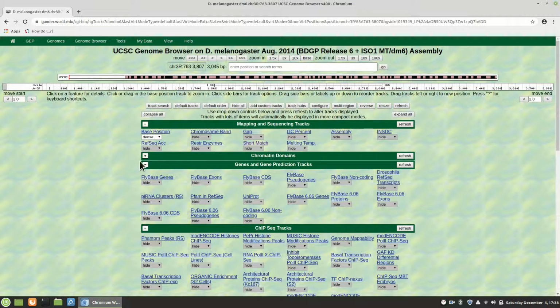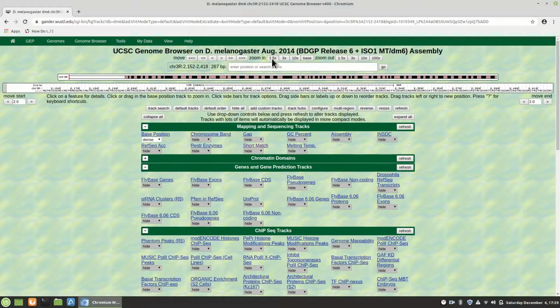So just be aware, you set your organism and your location like we did in the beginning. You zoom in and out to what you want. And like I said, you can zoom in so close enough to actually see the sequence, the A, C, G, Ts. Let's zoom in enough. There we go. We're slowly seeing the ACGTs.